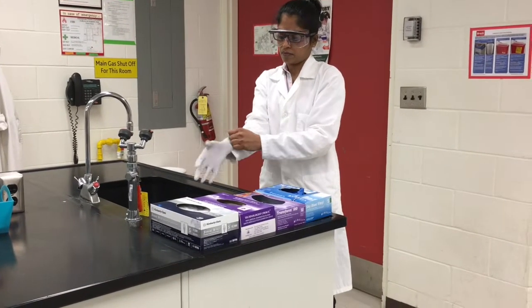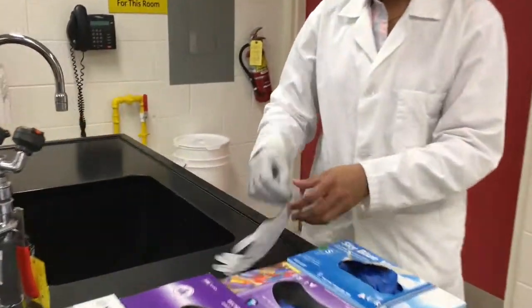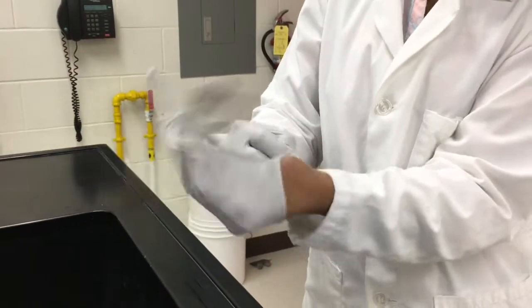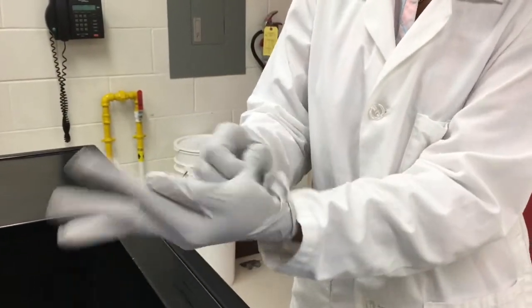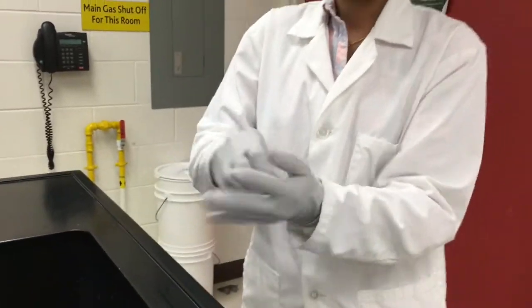Choose a pair of disposable gloves that are tight fitting to your hands and are not baggy. If at any time they become damaged or contaminated by a spilt culture, dispose of them in the biohazardous waste, wash your hands and don a new pair.